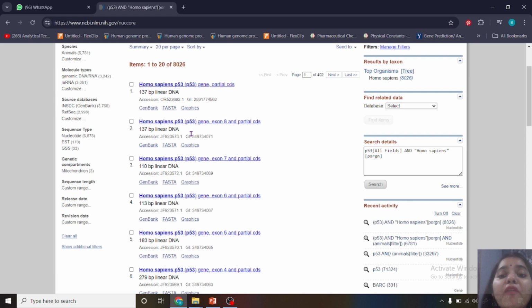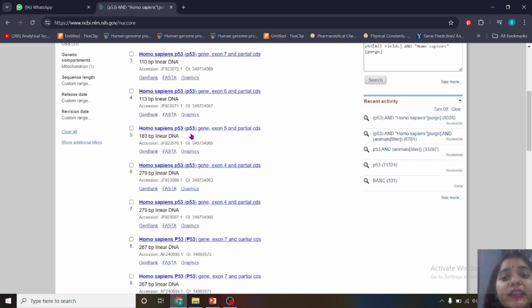For example, first we searched P53 gene in all fields. Then we searched Homo sapiens, then we searched the P53 gene in Homo sapiens. Here the other related searches are mentioned. This is the history, the recent activity performed on this page.